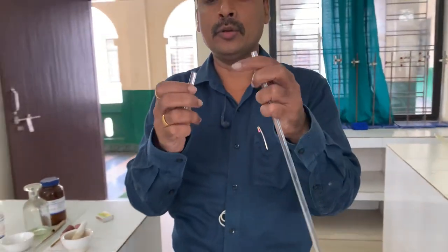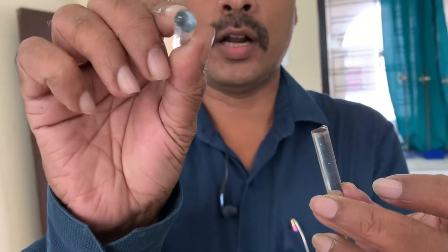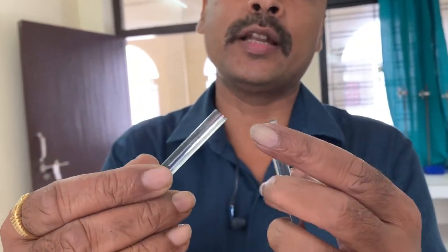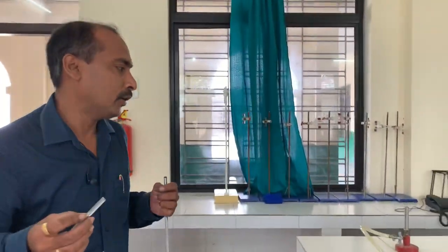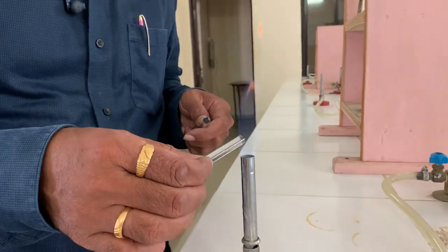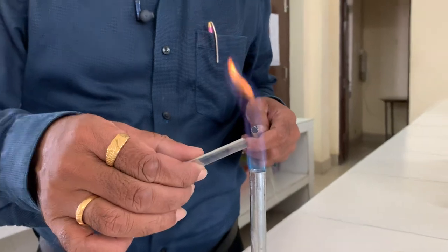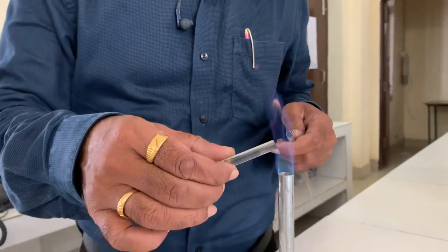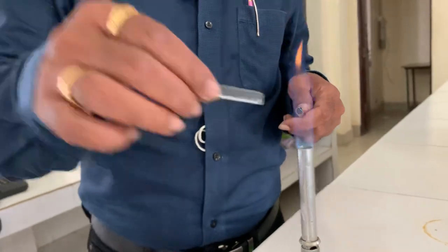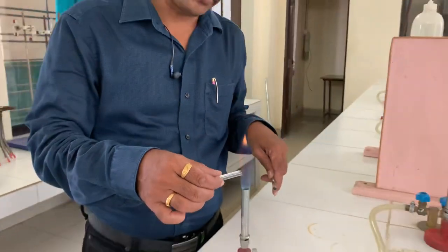Then slightly break it. You can see the surface is now very plain. If there is any sharpness on the surface, then you take it to the flame again — that is known as flame polishing. You move your glass rod with your hand, then it will be polished. Glass rod is used for stirring the solution and for adding solution drop-wise.